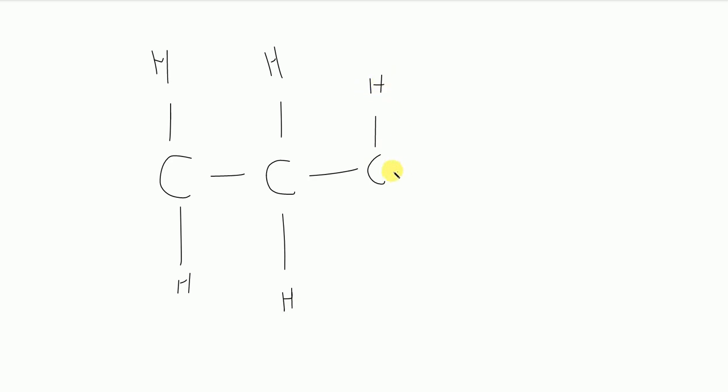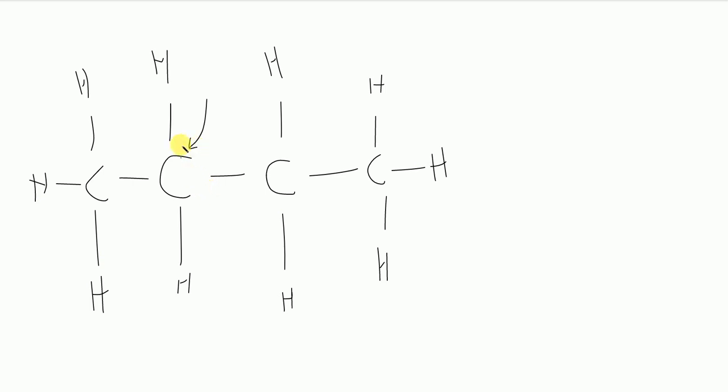Okay, and I'm going to go to the drawing pad really quick. All right, so if I have CH2 like this, and I have another CH2 like this, and then I have CH3, and I have this CH3, and let's say she wants to know the multiplicity value for the hydrogens over here, and she calls this, whatever, HA, right?